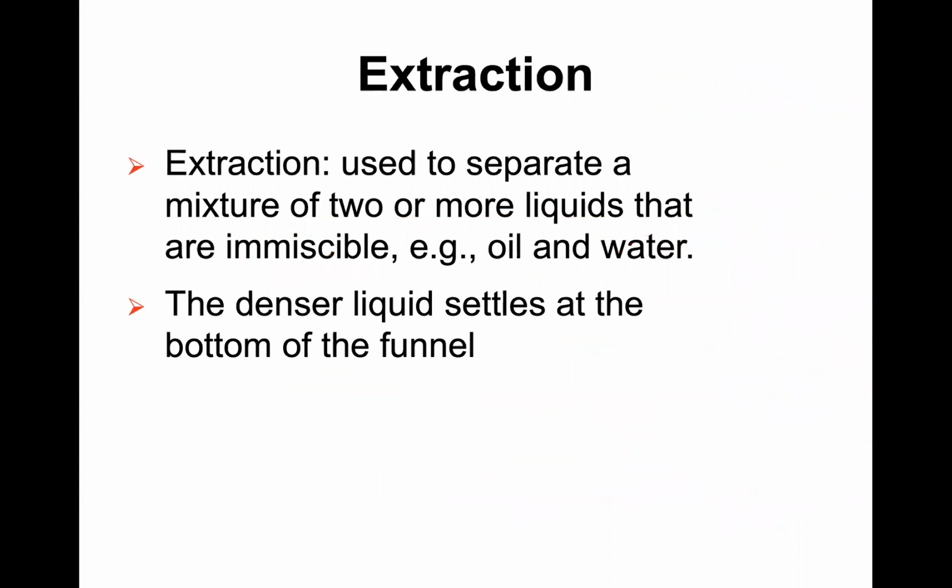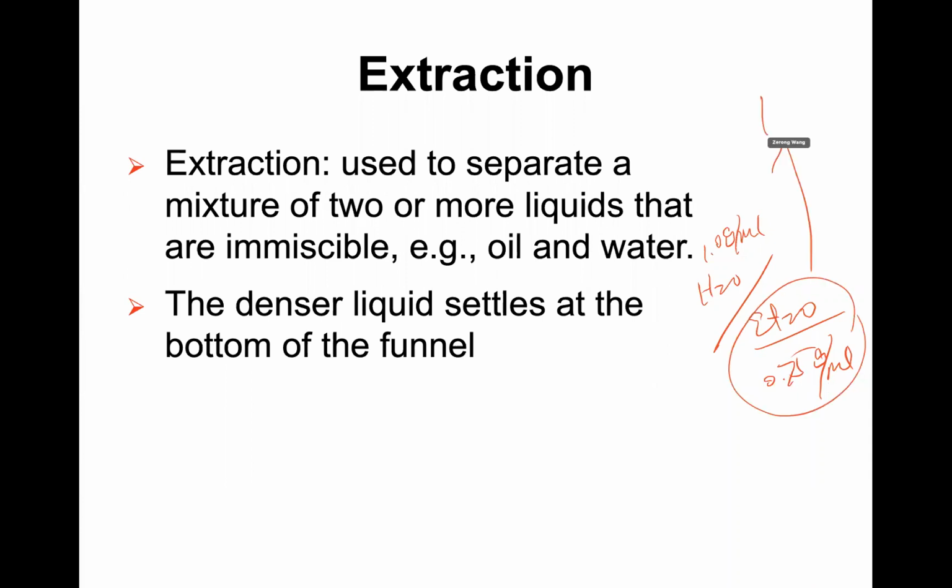Now let's see a last one. If you still use water, often we use water, and another case we can use diethyl ether. In this case, the density of water is still 1 gram per mL, but the diethyl ether is only around 0.75 gram per mL. So in this case, the organic layer will stay on top and the aqueous layer goes to the bottom. So you can choose which solvent you will combine with water for your separation, right? There are so many different solvents to choose from. So this depends on the compounds.